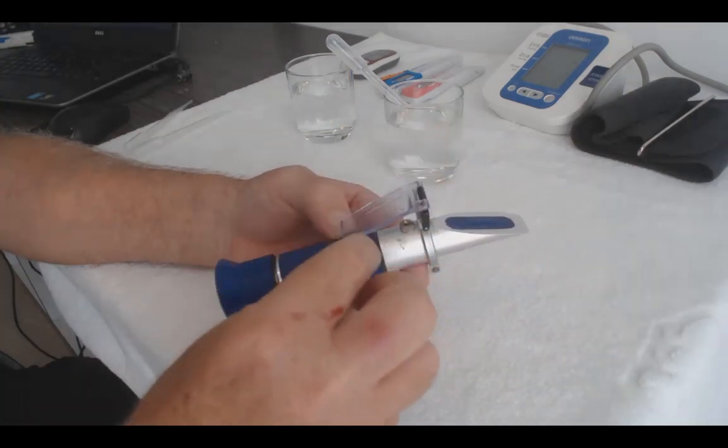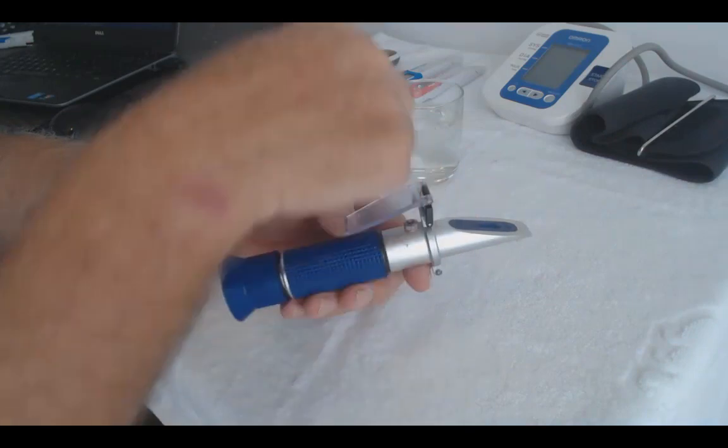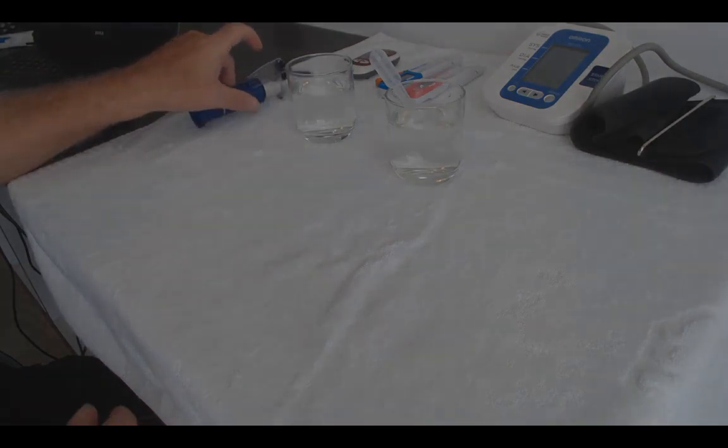Okay, and obviously make sure once you've finished using it, usually we'll have a tub here with disinfectant in the water, and it's just a matter of rinsing the tool there and letting it dry. Okay. So that's the refractometer.